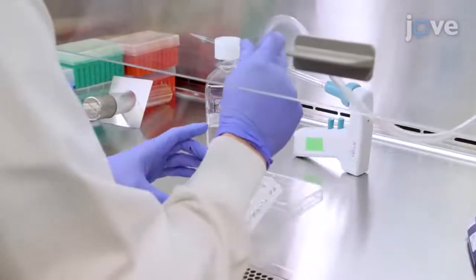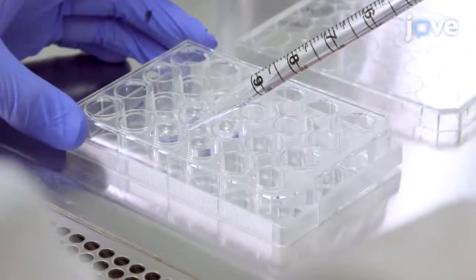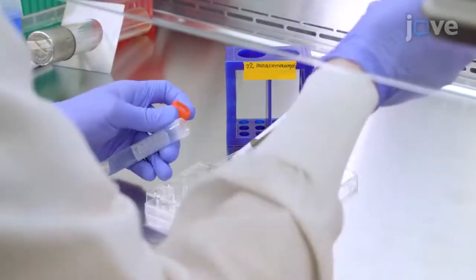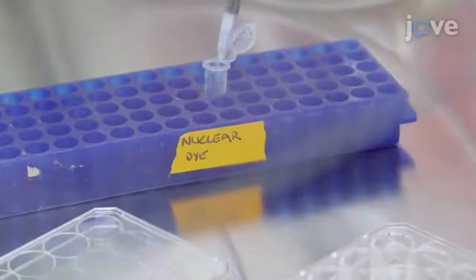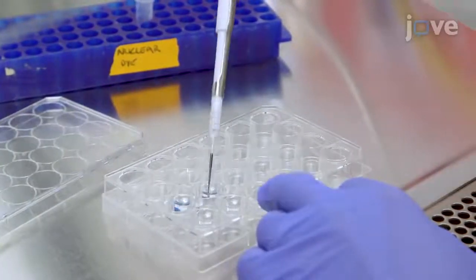At the end of the incubation, wash the cells with 1 milliliter of cold PBS per well 3 times for 5 minutes per wash, and fix the cells with 250 microliters of 2% paraformaldehyde per well for 30 minutes on ice protected from light, labeling the cells with an appropriate fluorescence nuclear dye during the last 5 minutes.